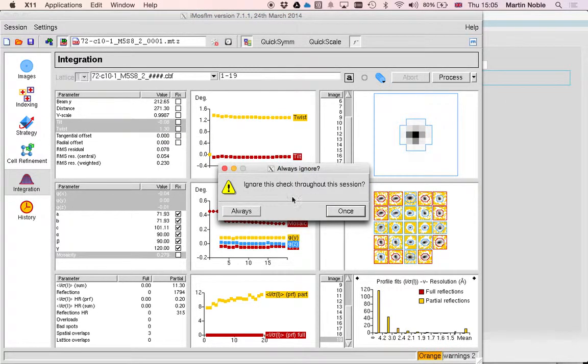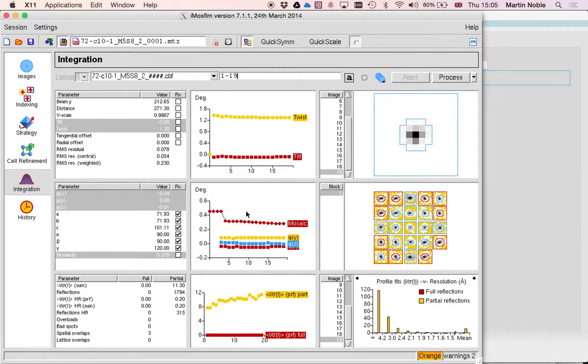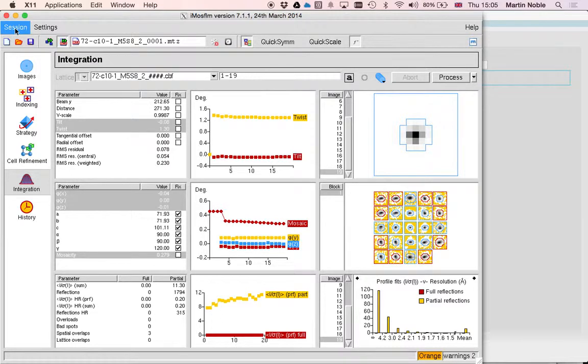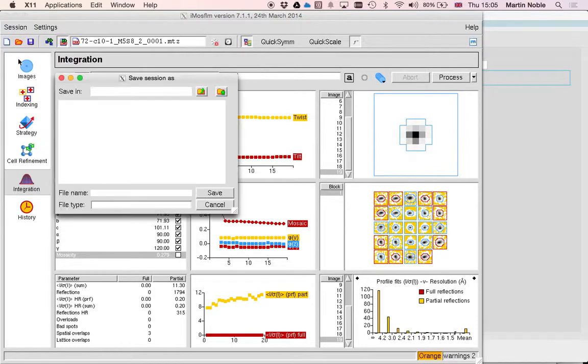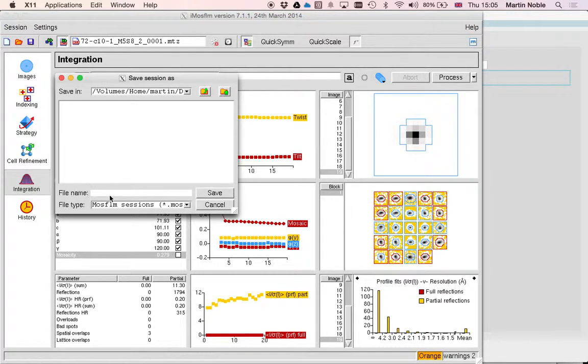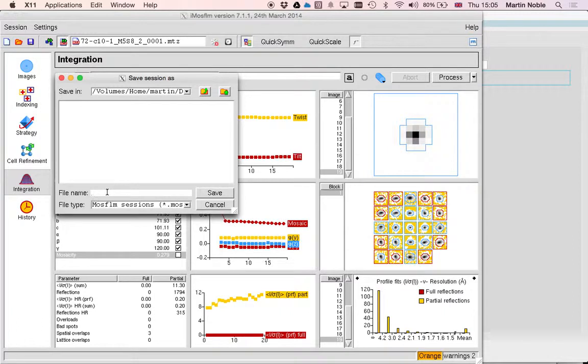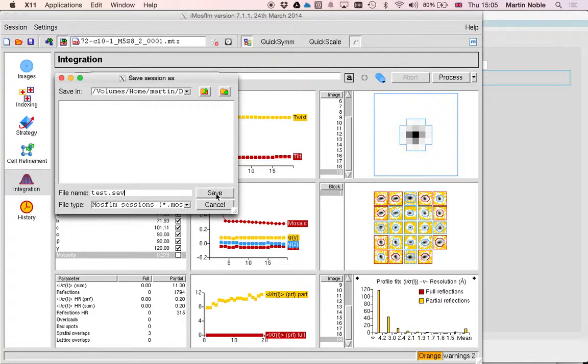I just gave it 20 frames that time and it's finished. So here's the first thing that I have to do to get this into ccp4i2. What I'm going to do is save the session and give it a name. It's important that that name ends with the file extension .mos or .sav.